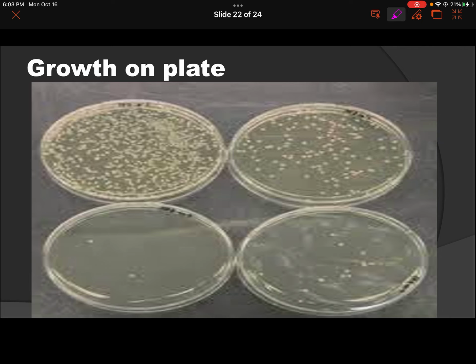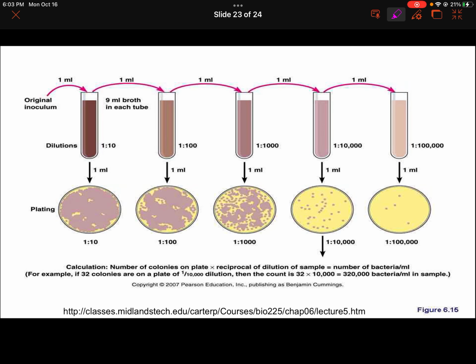This one is concentrated, and these are already diluted. Technically, as I have said, because you have diluted the last tube, where you pour the sample on the agar or mix it with the melted agar, it is presumed to have the least number of colonies.